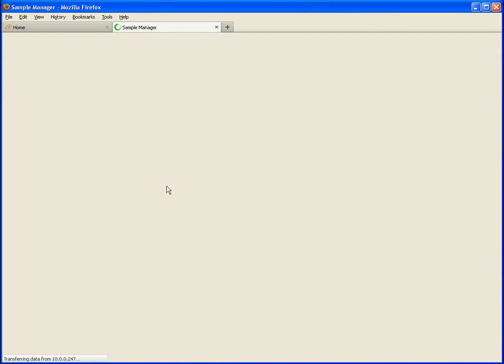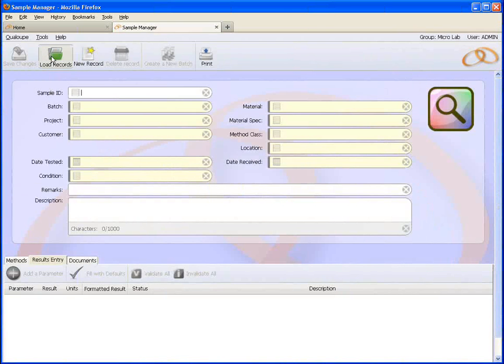If you want to try to find an exact phrase, or to start with a certain number of characters, or stop with it, or the string finish with a certain number of characters, you pin it by using a tilde symbol. And when this reloads, I'll show you that. Unfortunately, the reloading's a bit slow today. Here we go. Load records.